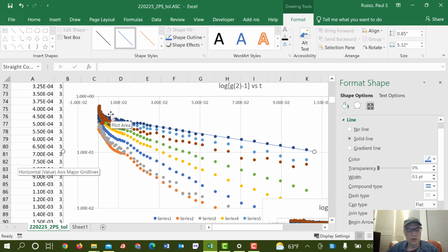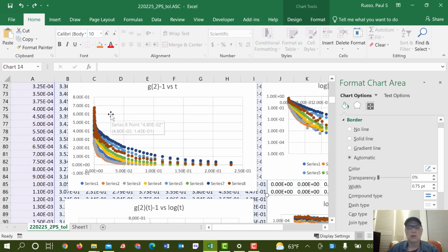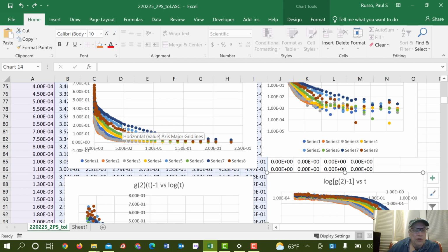All right, so I think I can Control Z my way back to someplace I'd rather be here. There we are. And in the linear scale, you can see how big that rapid decay is more easily. Let's see, if we think we start at like 0.7, the first 0.3 of it or so, down to 0.4, is the rapid stuff. So what is that? That's 3/7. 3/7 is whatever 3/7 is. 30% or so, I guess.